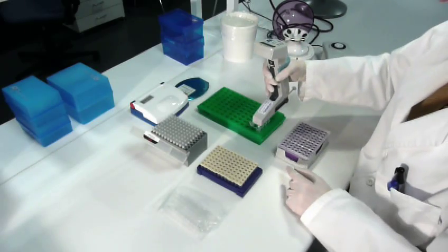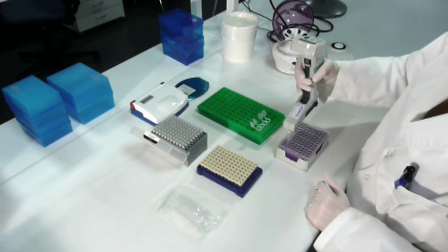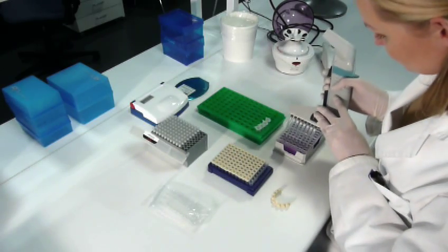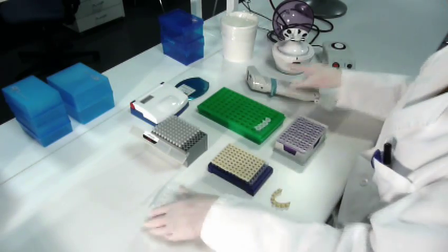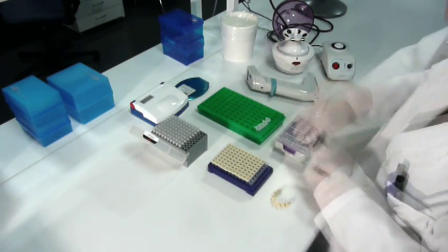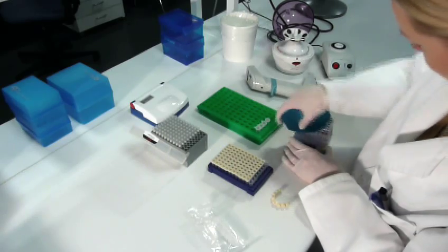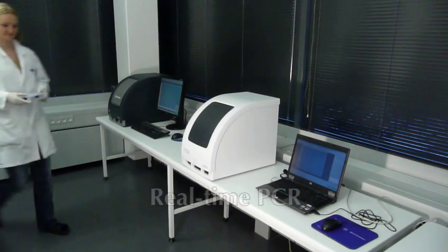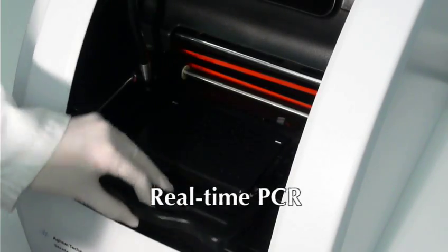In the real-time PCR step, the bacterial DNA is amplified to a detectable level, allowing the identification of the different bacteria present in the sample. The DNA is amplified and detected simultaneously, using a real-time PCR instrument.